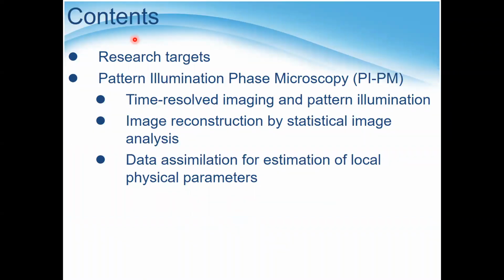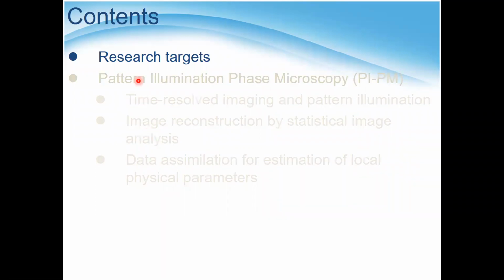So here's the content of this talk. First, I'm going to talk about the research target, and then move on to the development of the new microscopy, which is two topics. One is about the hardware things, and the other is statistical data analysis things in the last two topics. So first, let's move on to the research targets.